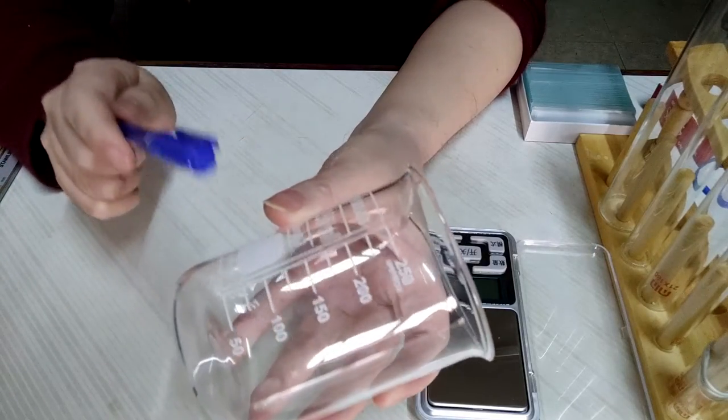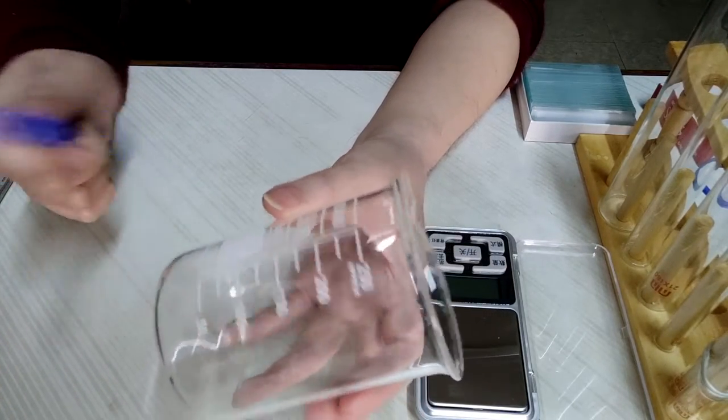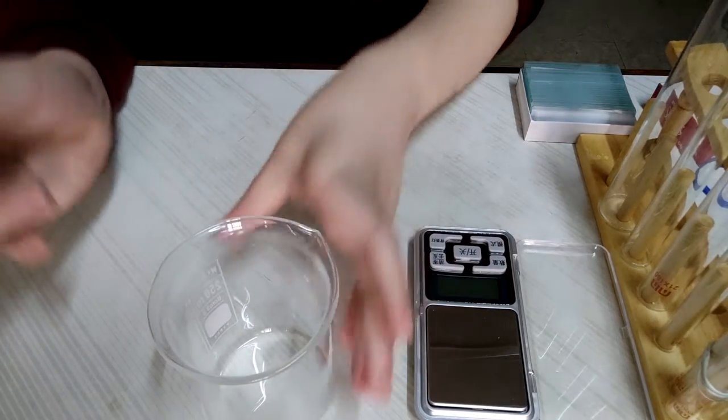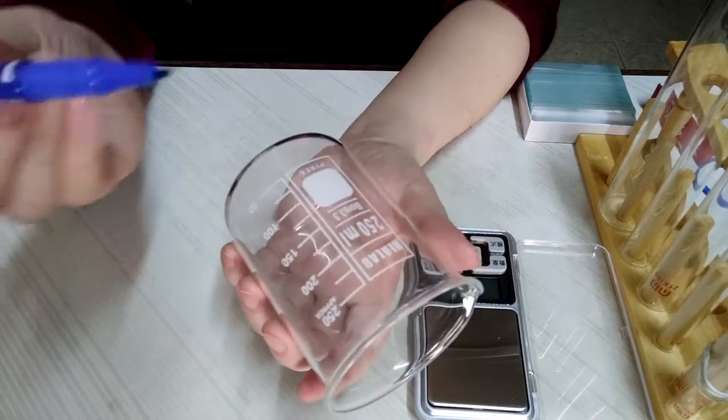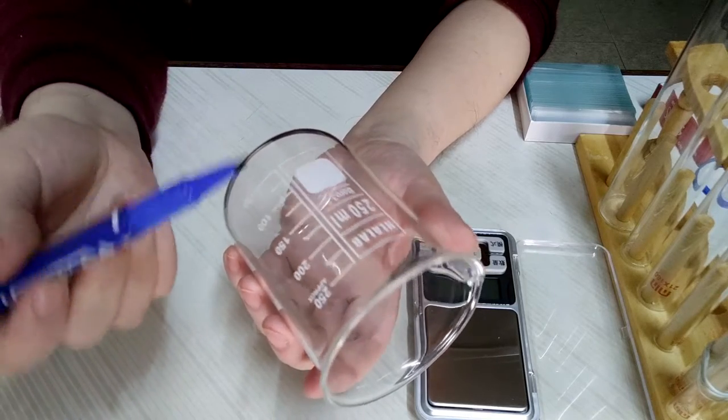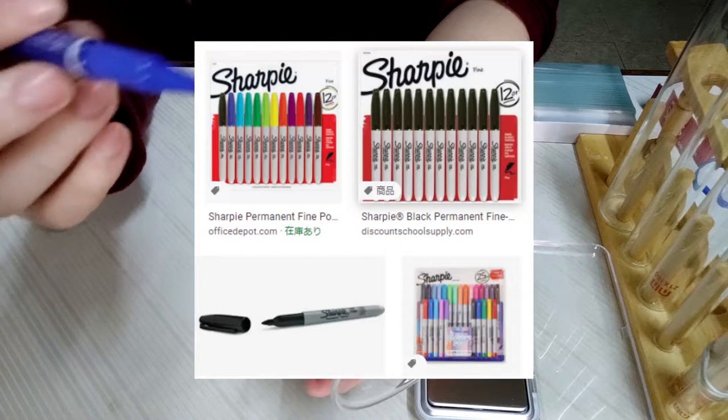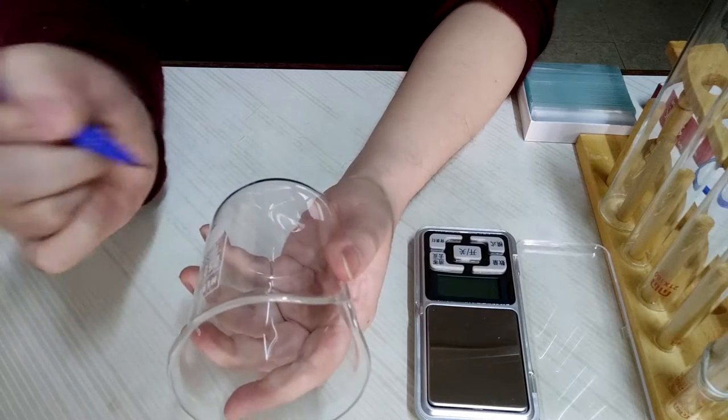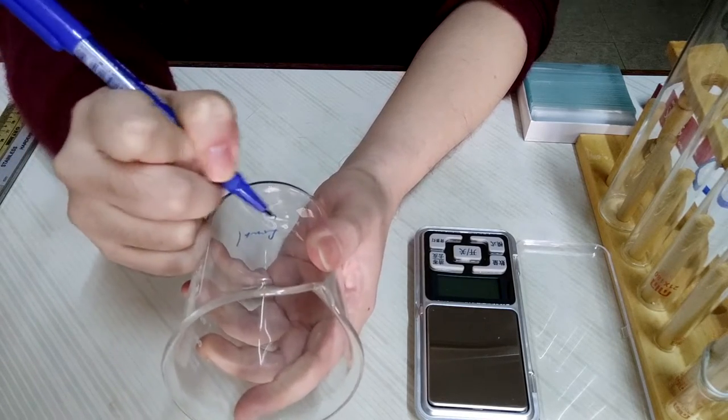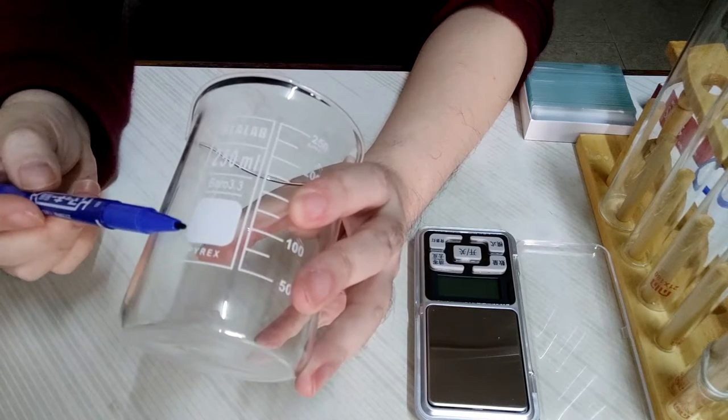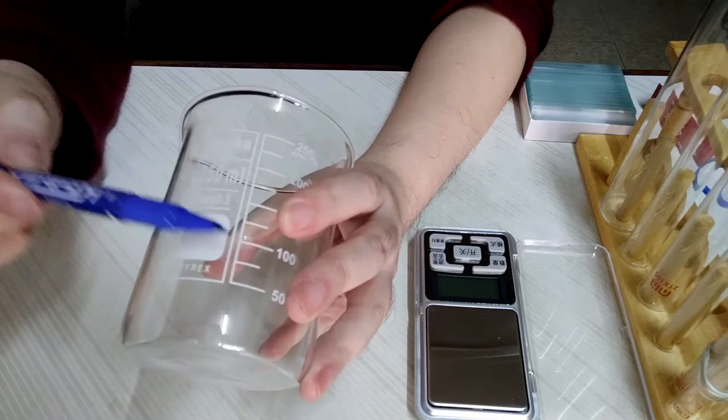So I am going to use this beaker to hold our water for final measurement, and I am going to label it. Most of the time in laboratory nowadays, we use markers like this. In the US or rural Europe, you will likely have heard Sharpies. But actually, any oil-based permanent marker should do. When labeling, try to avoid writing your oil-based marker on the white area.